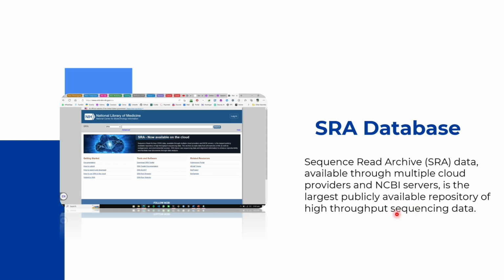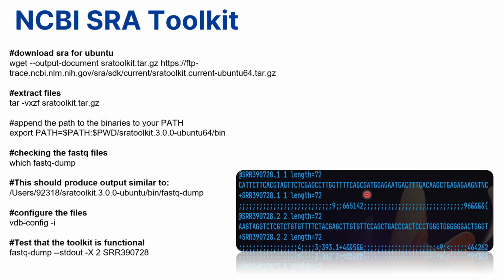So this is the kind of data that we generate from sequencing companies like Illumina, 454, and other sequencing companies like that. So we need this type of data in a repository. Which kind of repository contains all that data? It is NCBI SRA. NCBI SRA contains all the sequence read archive data for our high throughput sequencing data. So it's an archive that contains all the sequencing data.